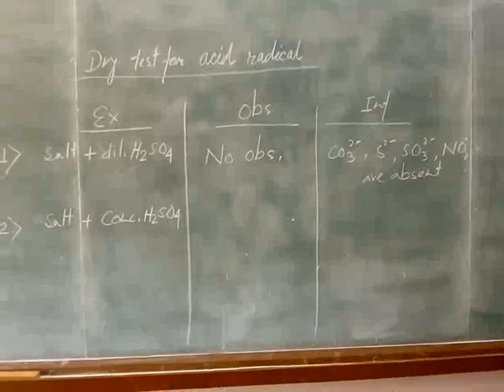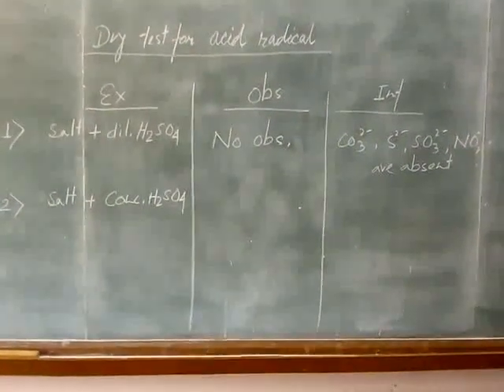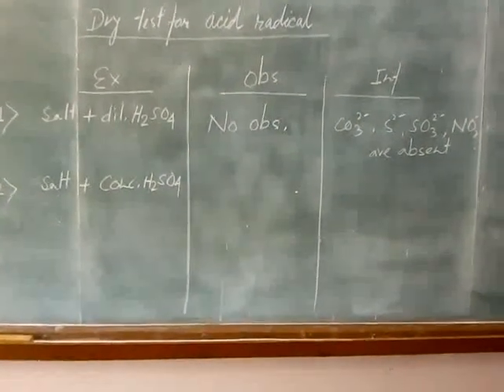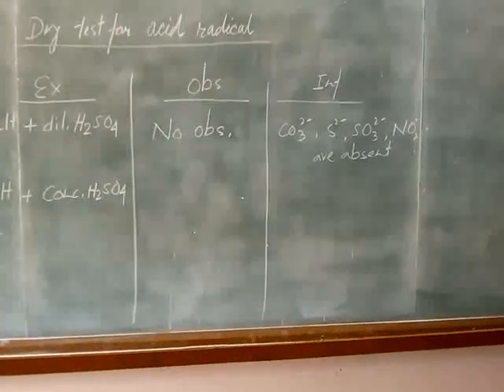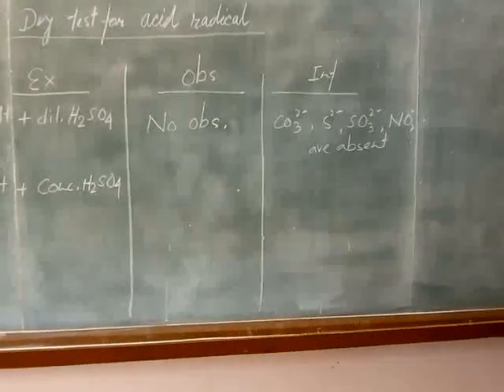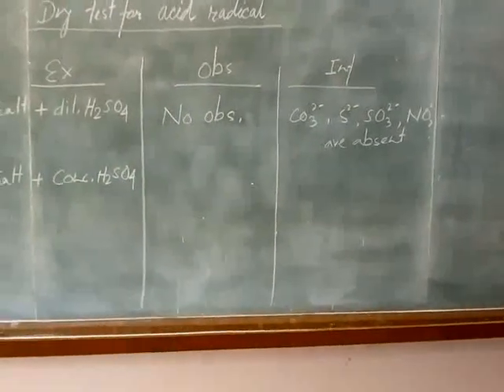Therefore, here we can write in the dilute sulfuric acid test, in observation no observation, and in inference carbonate, sulfide, and nitrite are absent.